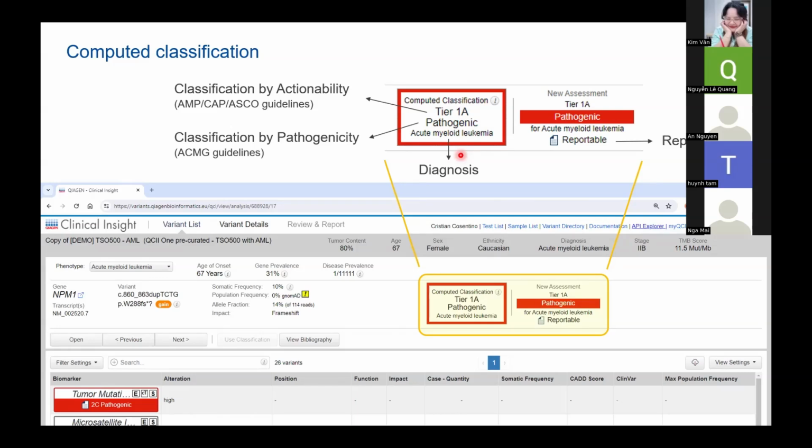You run that and standardize the wet lab, and you see whether the same thing is detected at the same allele frequency in the secondary analysis like CLC Genomics Workbench. And also, if we compare between Illumina, Ion Torrent, and long reads like ONT, there will be a lot of difference.